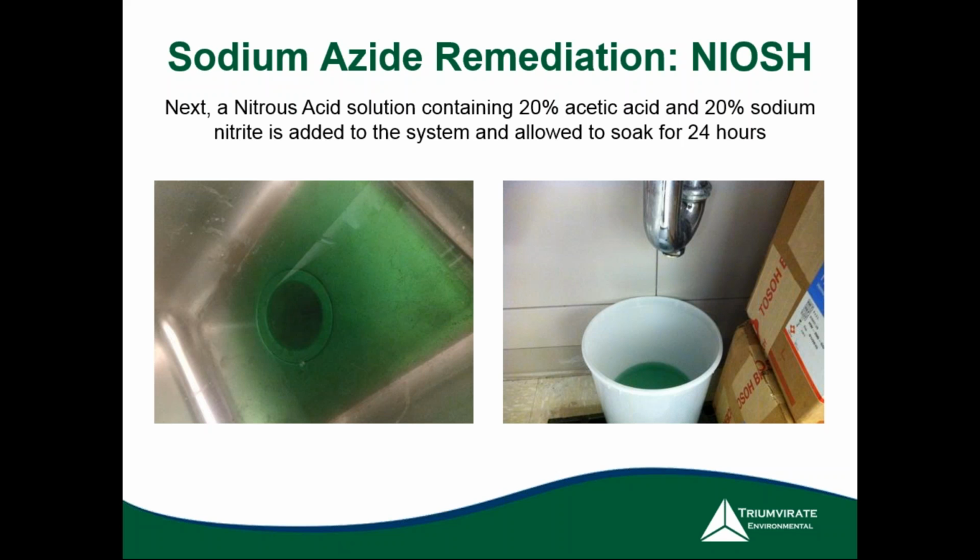That acid, at the same time, is doing what the sodium hydroxide did. It's breaking down some of the components of that metal to allow it to get into those interstitial spaces. And as a result, if you look to the right, you get leaks in the system. So any sort of clean outs or areas where there's fittings, those start to leak over time. So we have personnel on site with secondary containment collecting the leaks and then reintroducing fresh acid into the system as needed to keep it full and make sure that the acid is coming into contact with all the metals that we're looking to decontaminate.